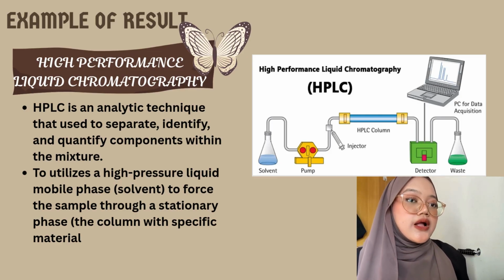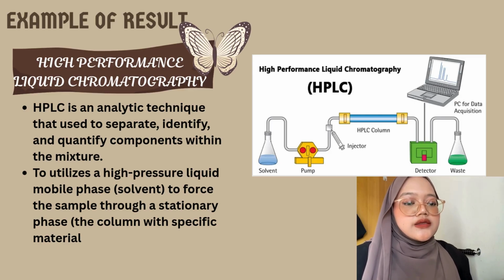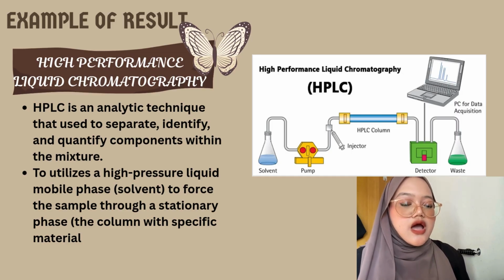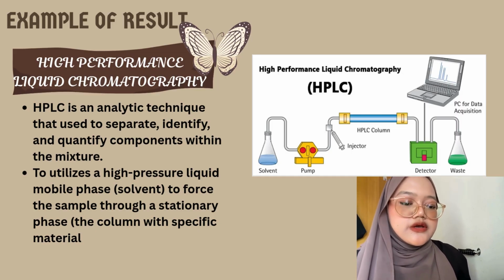Lastly, HPLC, or high performance liquid chromatography. The diagram shows a complex system involved in this high precision technique used to separate, identify, and quantify components within a mixture.